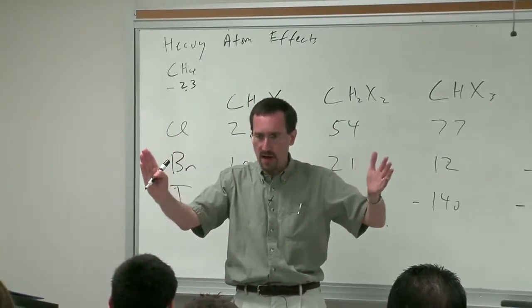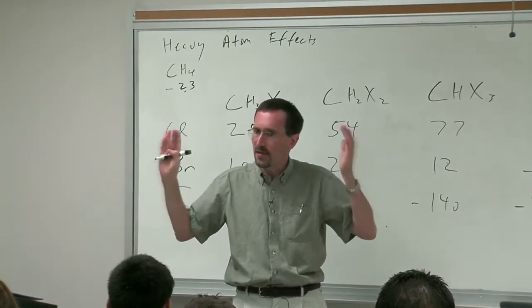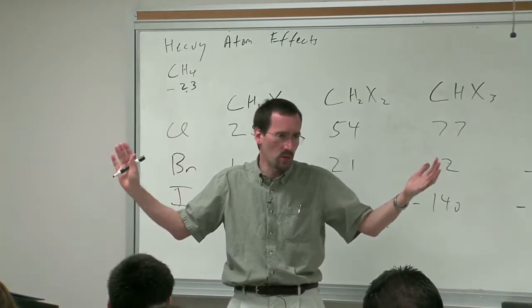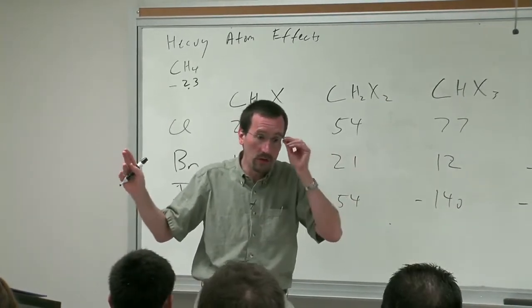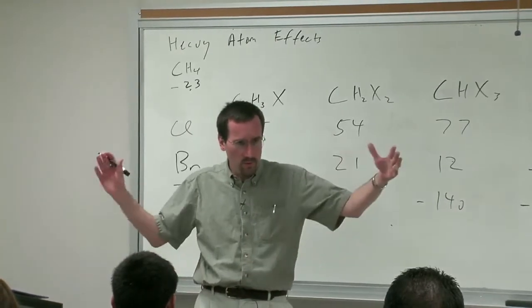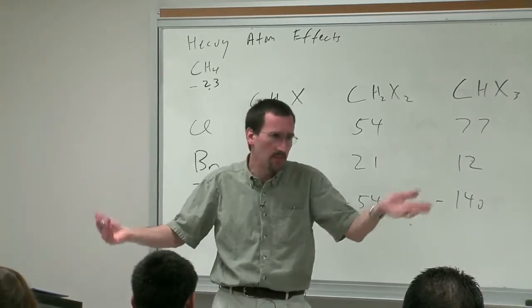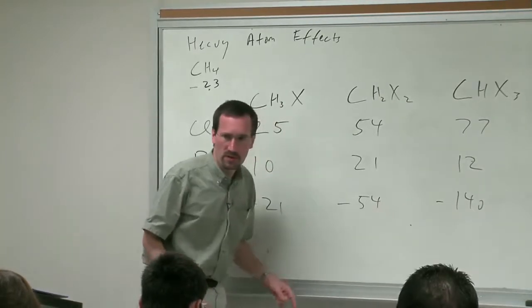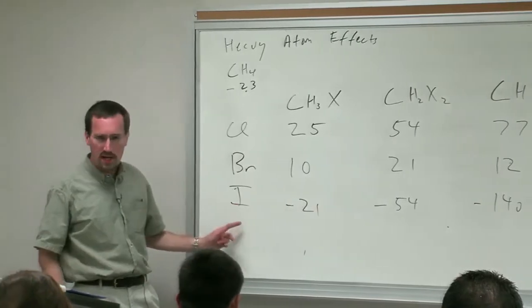That sweep width is the spectral window that you look at. If you have a compound that you expect to be very far downfield or very far upfield, this is true in the proton NMR as well, you can just increase your sweep width, field width, by whatever number of hertz you like. You type in the parameter SW, get a bigger spectral width, and then you can see, for example, your carbon that's attached to iodine. Same thing with protons attached to iodine.